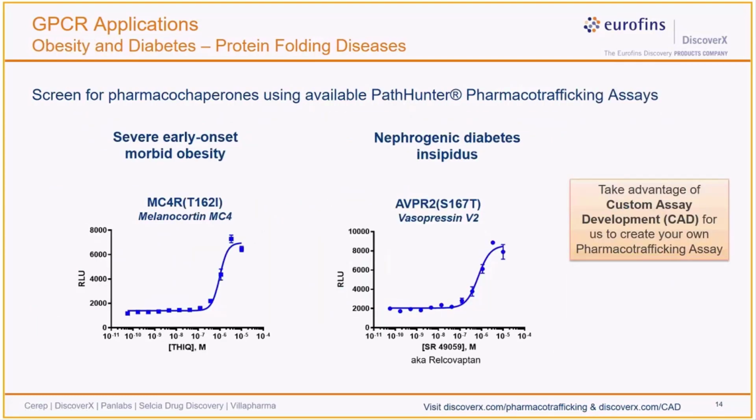All right, this next slide shows 2 more examples or case studies of GPCRs. Both of these targets have multiple known natural mutations, okay? The results in the receptor defect, the trafficking, and leads to their specific disease. So let's start off to the left.